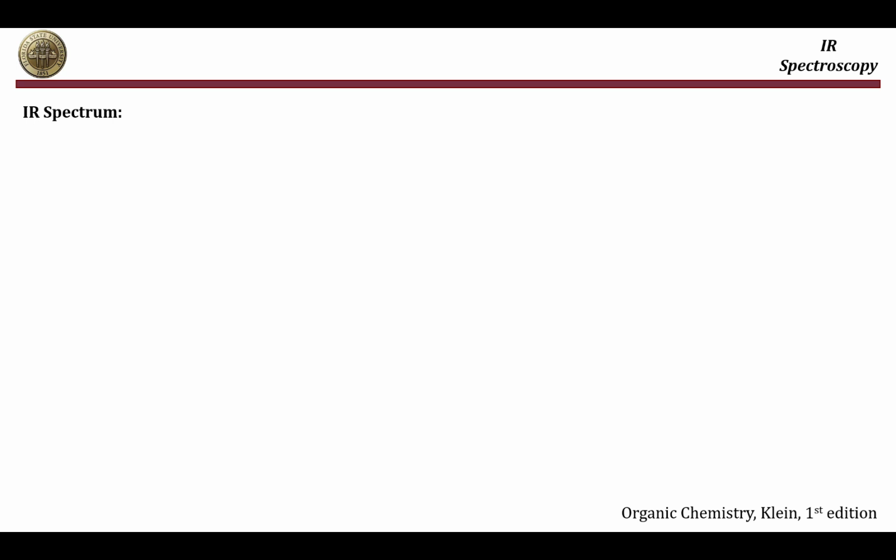signals. In this video, we will talk about the practical steps that should be used in order to read an IR spectrum, and how we can read and identify the different functional groups using an IR spectrum.